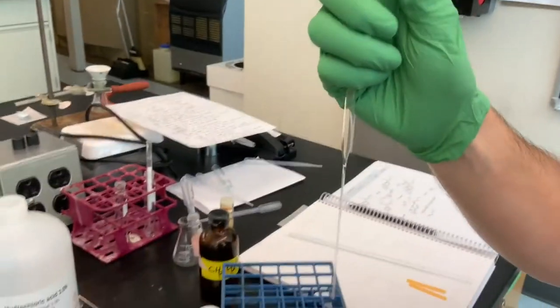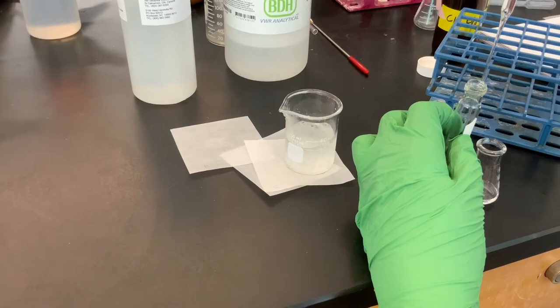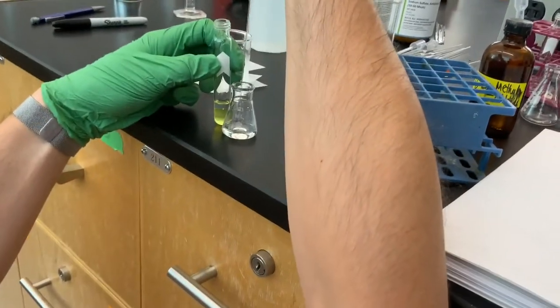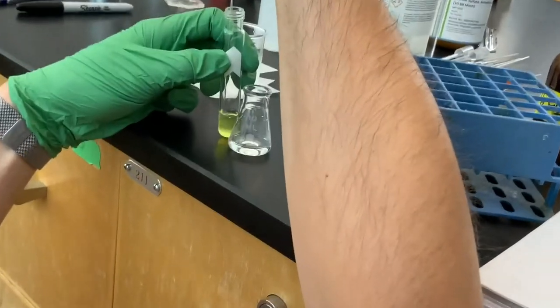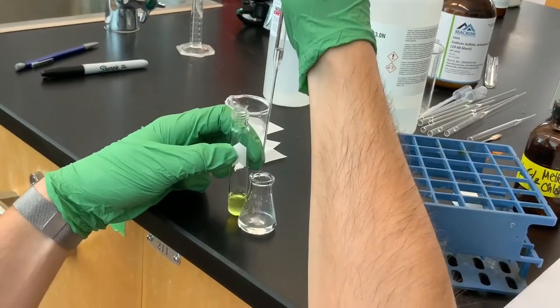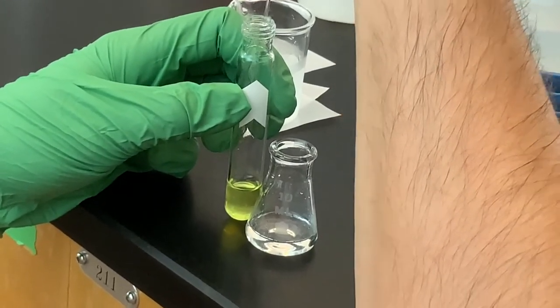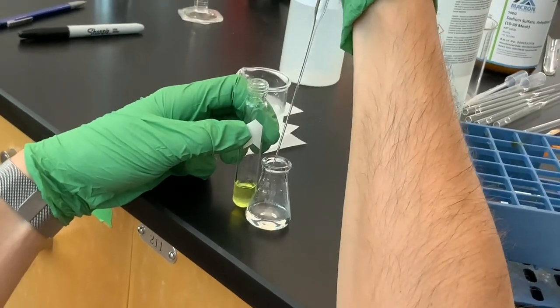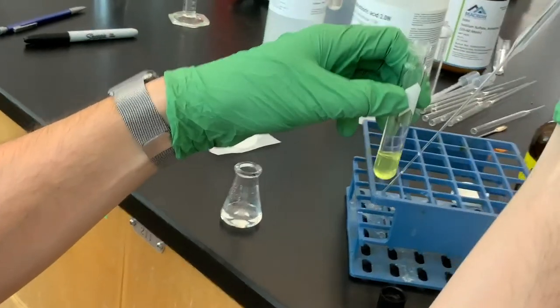All right, so I'm going to again, very carefully, using the same pipette now, draw up my aqueous layer and combine it with my first extraction. And so you can sort of see that methylene chloride layer that's kind of on top, which is annoying, but it always happens. So you have to be vigilant and try and avoid that. But we do our best. I think we're doing great. Yeah, and we avoided drawing up any methylene chloride that has the benzoic acid and 9-fluorenone at this point in time. All right, so now the 10 milliliter Erlenmeyer flask has the protonated benzocaine, the water-soluble salt, and this organic layer I'm going to set aside for a second.